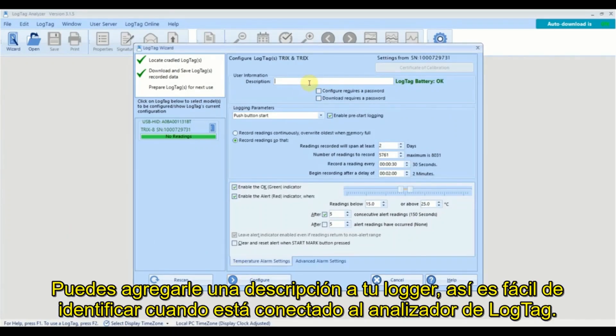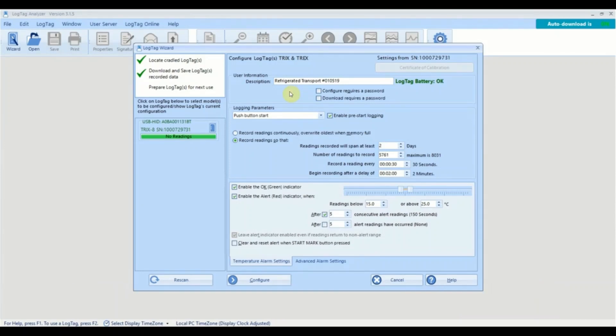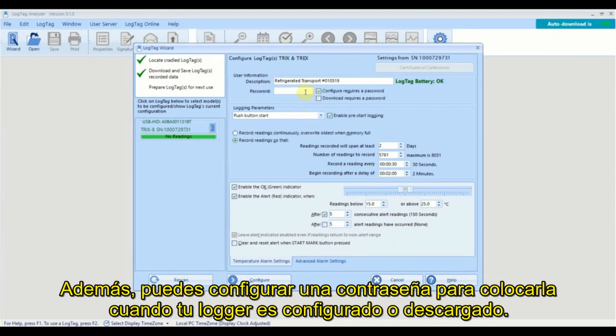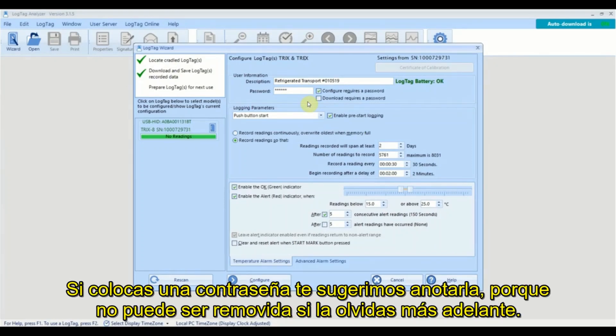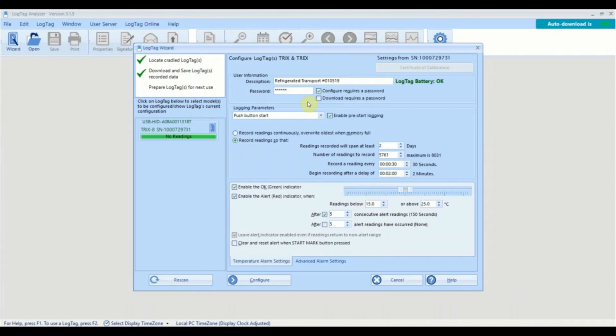You can add a description for your logger so it's easy to identify when the logger is next connected to LogTag Analyzer. You can also set a password to be entered when your logger is next configured or downloaded. If you set a password, we strongly recommend writing it down as it can't be removed if you forget it later on.